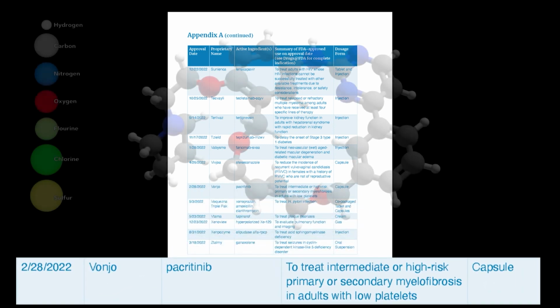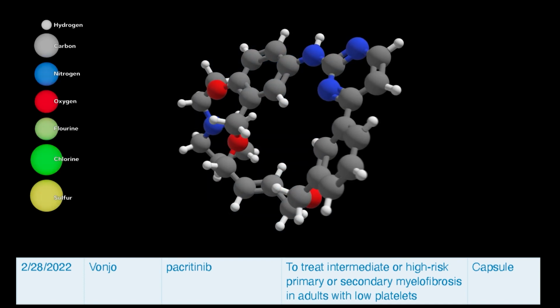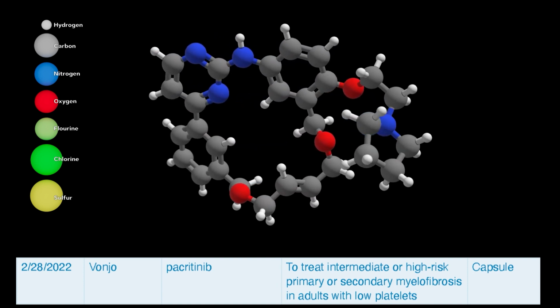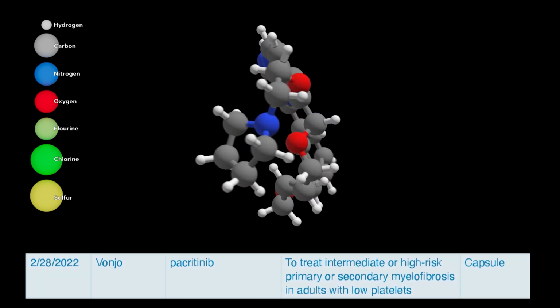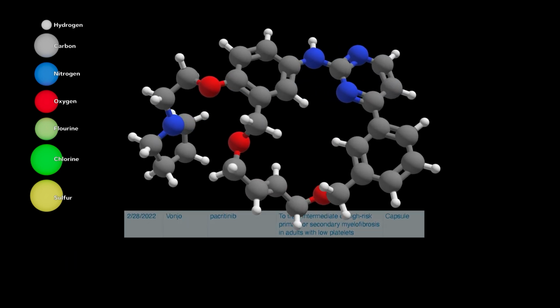Overall, HPLC is an essential tool in drug discovery, offering precise and sensitive analysis of compounds, facilitating separation and purification, and providing crucial information on the characteristics and behavior of potential drug candidates.